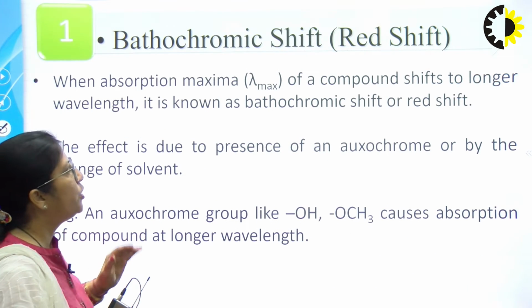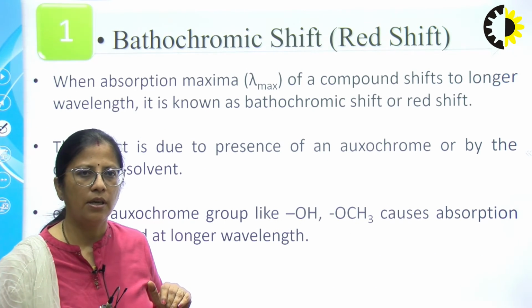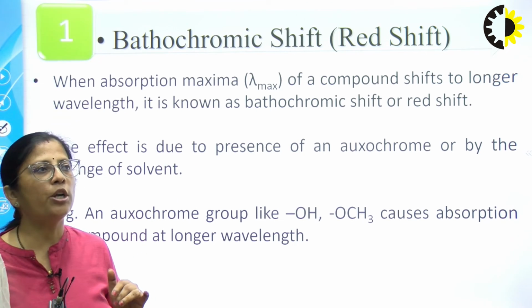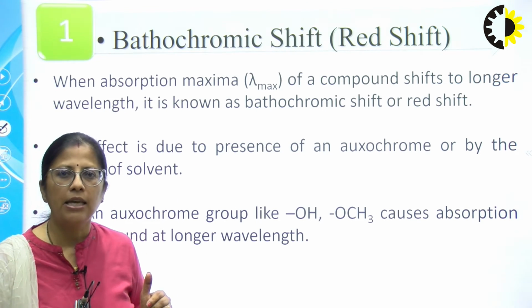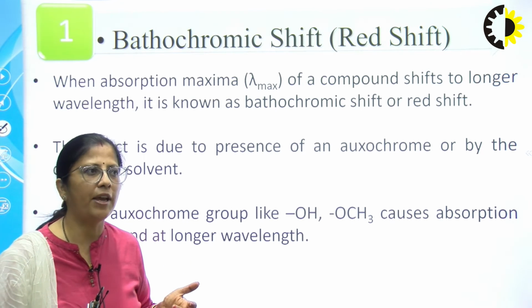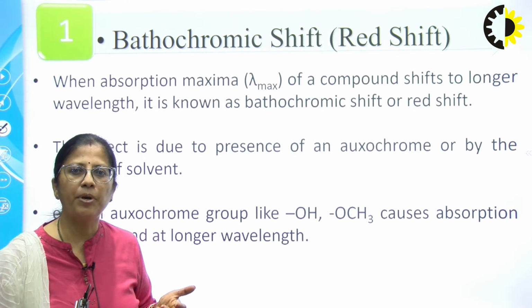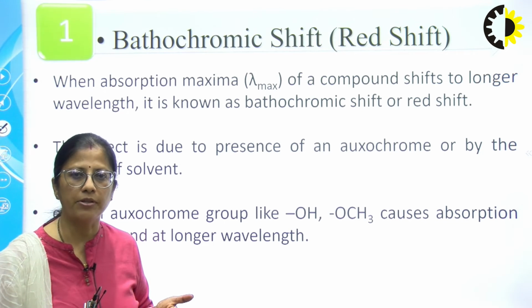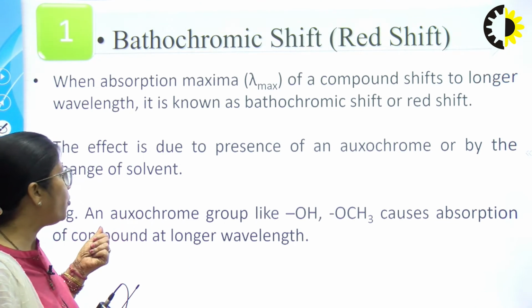Coming first to the bathochromic shift. When the absorption maxima of any compound shifts to a longer wavelength, it is known as the bathochromic or the red shift. This effect is generally seen by the presence of either an auxochrome or by the change in solvent. One example I am going to take here.